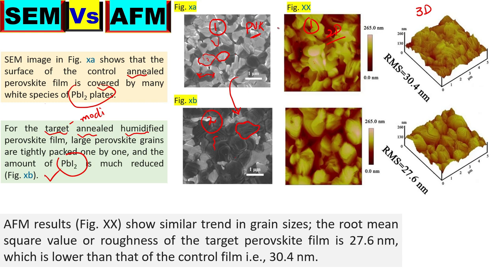Now let's discuss the AFM image. This is basically sample 1 and this is sample 2 here. Here the SEM results must be validated. We can see that the AFM image shows similar morphology, a similar surface. This is a kind of mixture of white and black here. If you look at sample 2, we have big grains here, and it is basically similar to the SEM images.